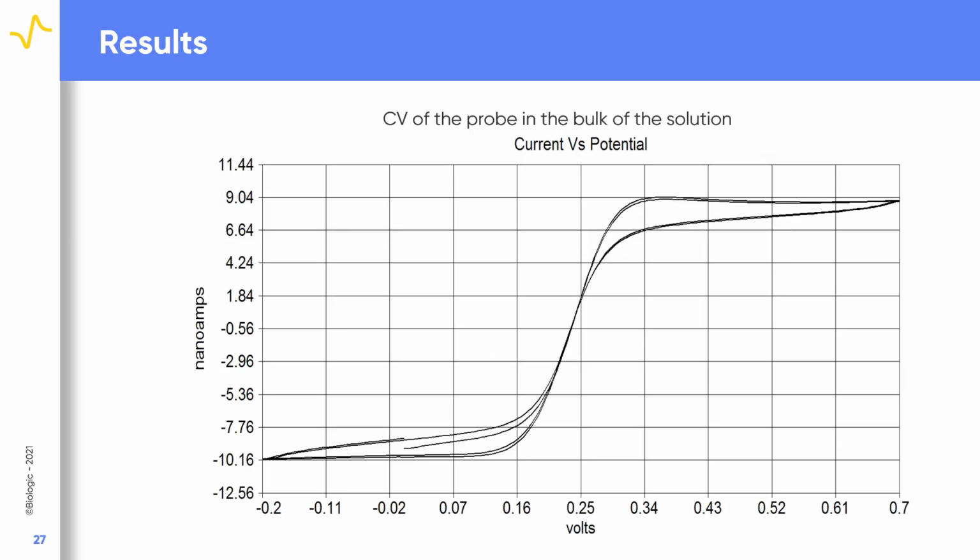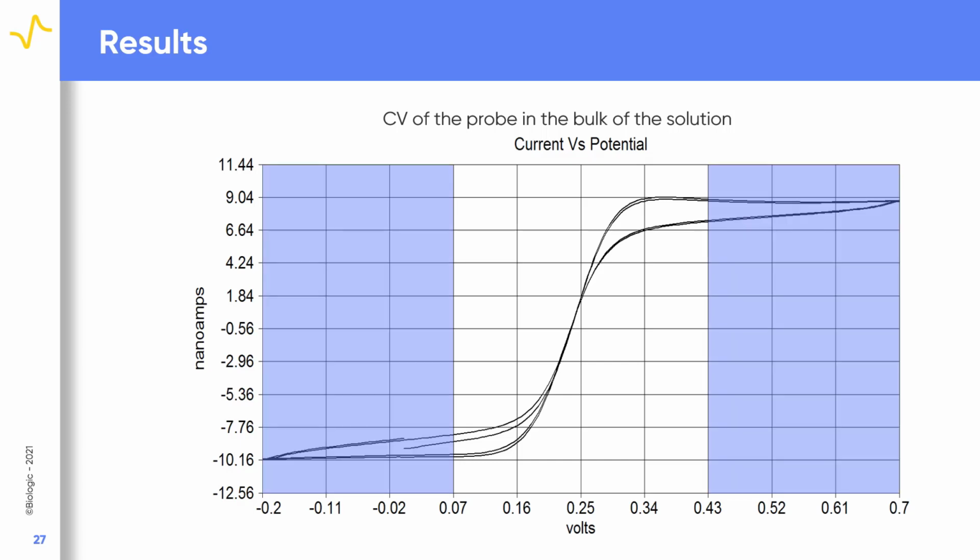The first step for any dc-SECM measurement is the measurement of the cyclic voltammetry of the probe. When working with a redox mediator electrolyte system you've not used before, the CV is performed to determine an appropriate bias potential. The aim is to work at a potential which shows diffusion control, which is apparent in the CV by the current plateauing. The potential should also be selected so the current is non-zero. In this case, we could work in any of the regions now highlighted in blue.